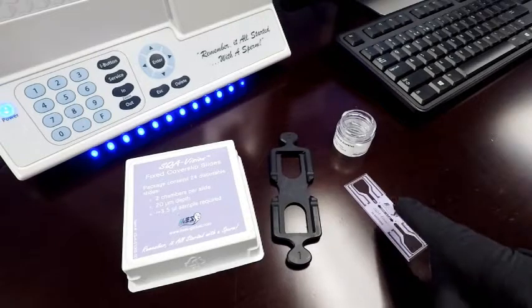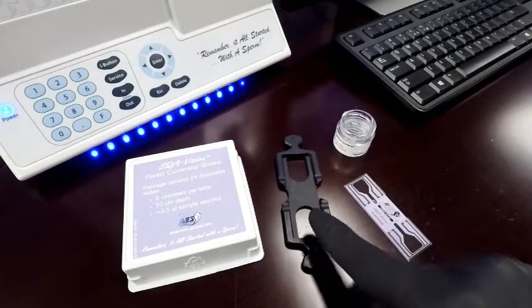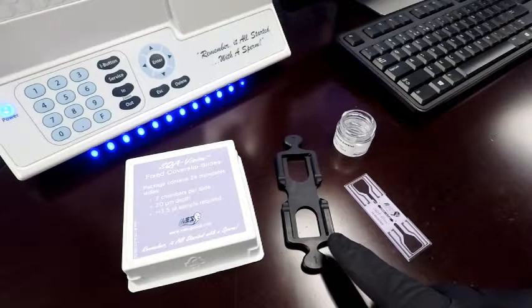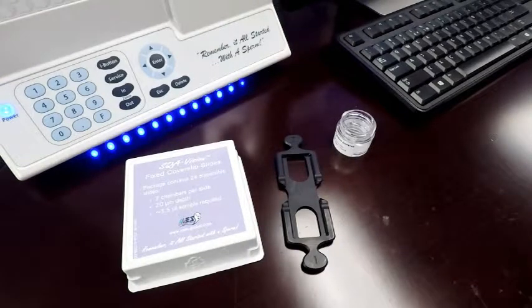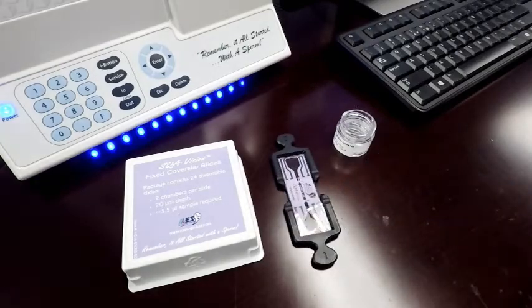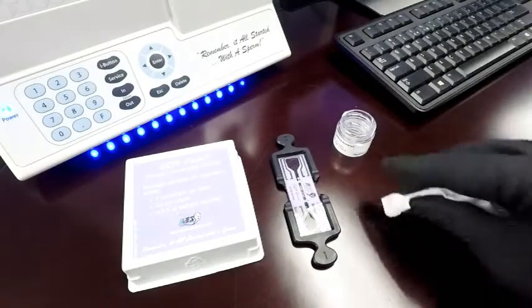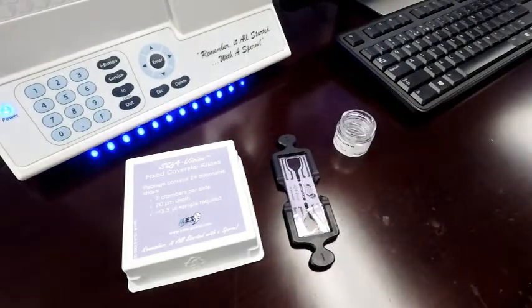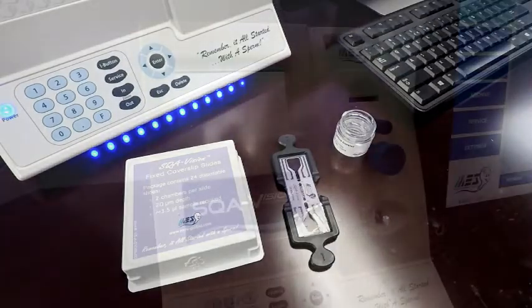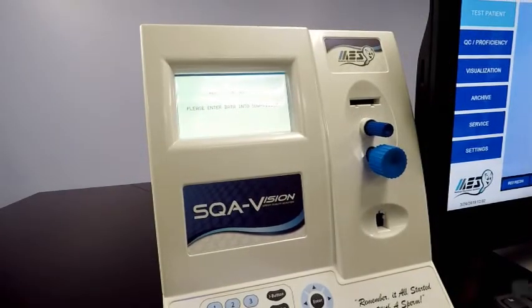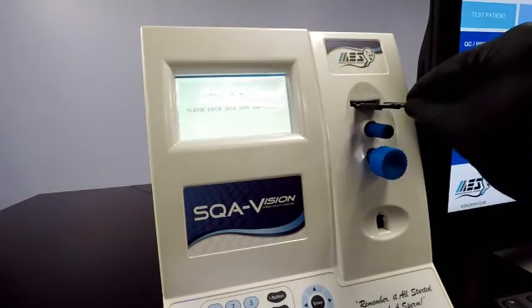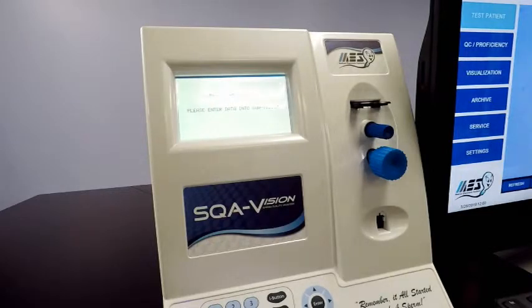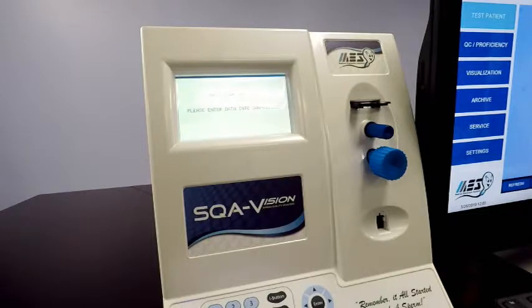Then we're going to place our slide on the slide adapter. This is what's actually going to go into the visualization system on the SQA Vision. Just pop it on, and then grab a kimwipe, just a standard kimwipe. Just kind of dab off any extra. From there, we're just going to pop it into the system.